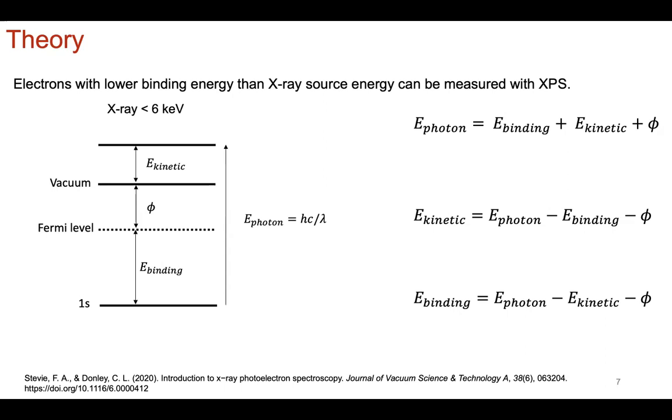Yes, so when you set up the experiment, this is operational theory. When you scan and pick your energy, it's now built into these instruments and the software that goes with the instrument, that when you pick a certain energy, you're really looking at a particular element, or at least several elements, because sometimes they're overlapping, like the 1s binding overlaps with some Auger with another element.